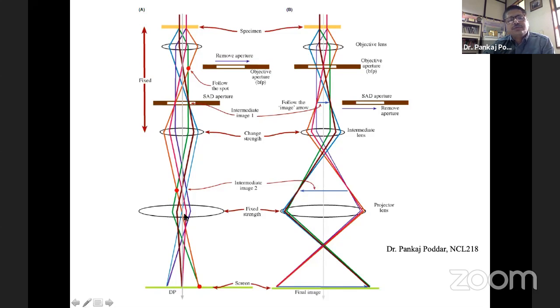Using these lenses, you can focus diffracted beams from different planes at different spots. So you get the 0 0 0 spot in the center, and then all kinds of spots from beams diffracting from different planes, focusing on these different spots. As I mentioned, G, minus G, 2G, 3G.